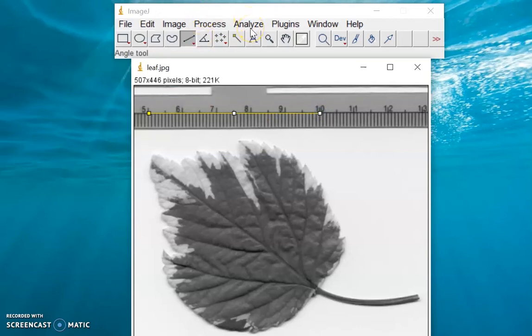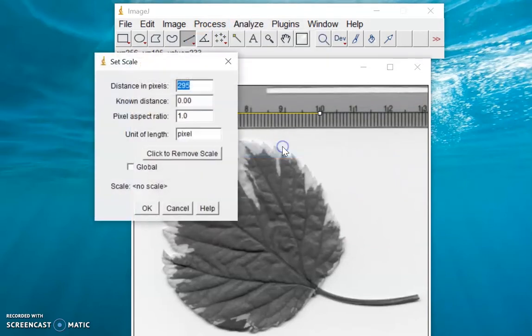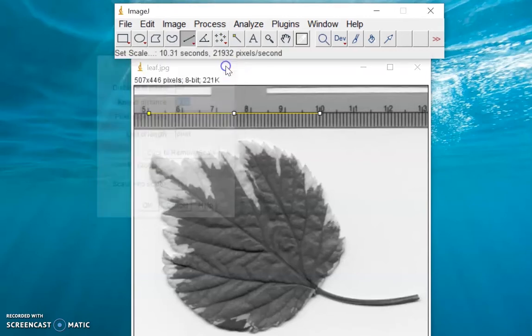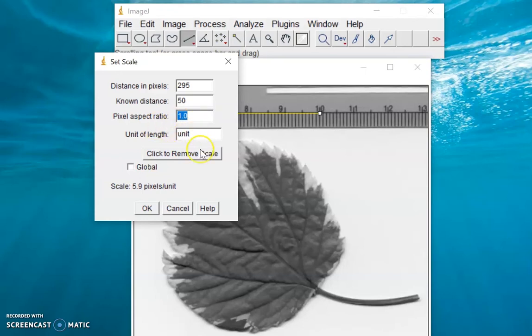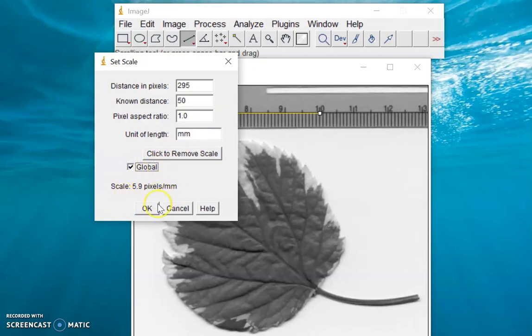After this, click Analyze, then Set Scale. In the Set Scale window, enter 50 in the known distance. The pixel aspect ratio is 1 — that is 1 by 1 — as stated by our metadata. Pixel aspect ratio is a mathematical ratio that describes how the width of a pixel in a digital image compares to the height of that pixel. For the unit, let's set this to millimeters. Click Global — and this is our scale for this image. Click OK.